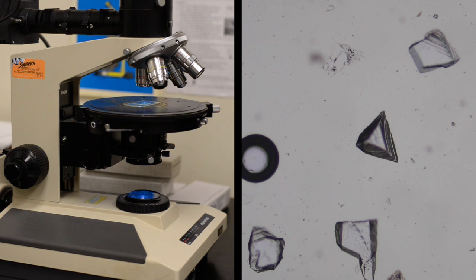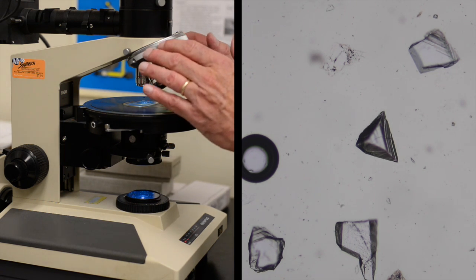All right, so now that you know a little bit about the history of the Becke line, where the name comes from, and what it's designed to do, I'm going to show you how the Becke line test works. As you see, in this field of view there are several grains, in this case mounted on a glass slide in an epoxy manufactured by a company named Buehler, and the index of refraction of the epoxy is about 1.53. Using the Becke line test, we can determine whether the mineral's index of refraction is higher or lower than that of the epoxy. So we're getting a relative indication of index of refraction.